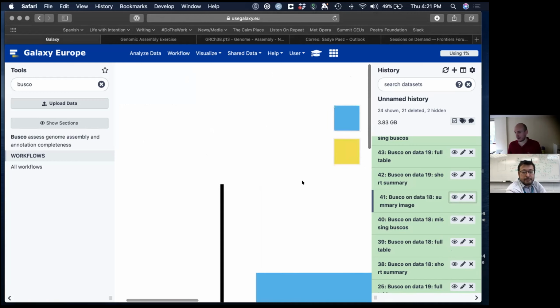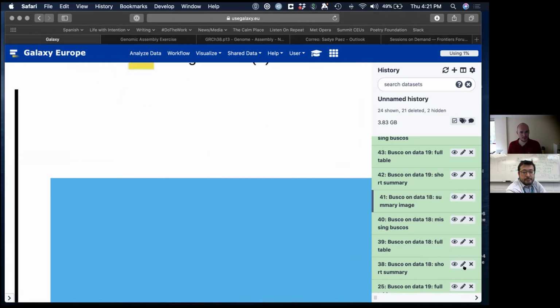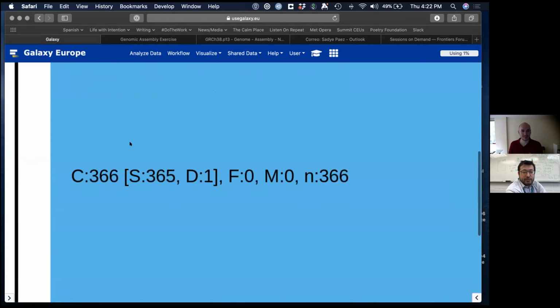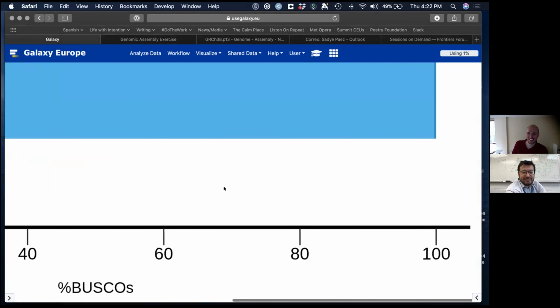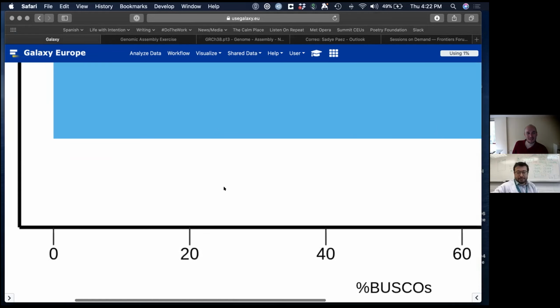Oh, it does give you this. Oh, I guess when we pick all of them, oh, that's really big. Oh yeah, this is rough. Where is it? I can't even see it. It's somewhere here, I imagine. I don't know.